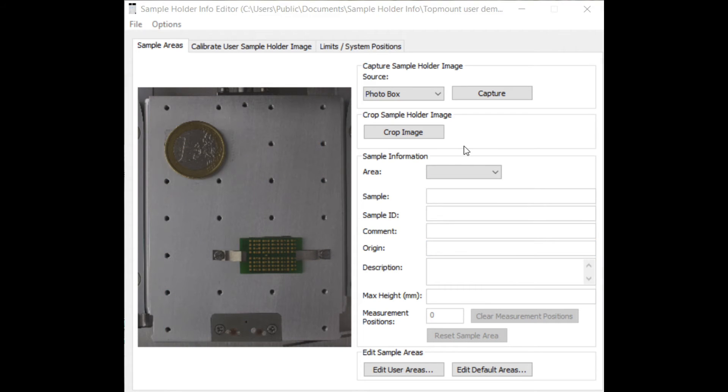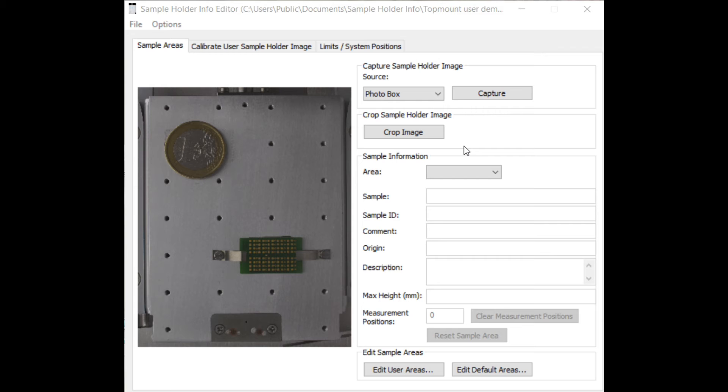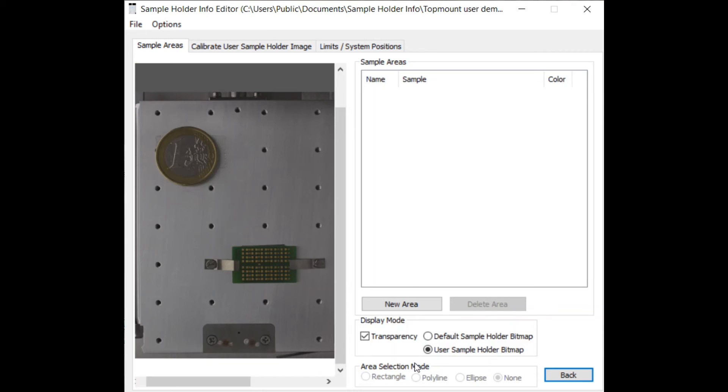To use the automated navigation on topmount sample holders you must add a photo to the SHI file. The topmount sample holder does not have distinct positions. Therefore, the user has to determine the sample areas. Press the edit user areas button to do so.